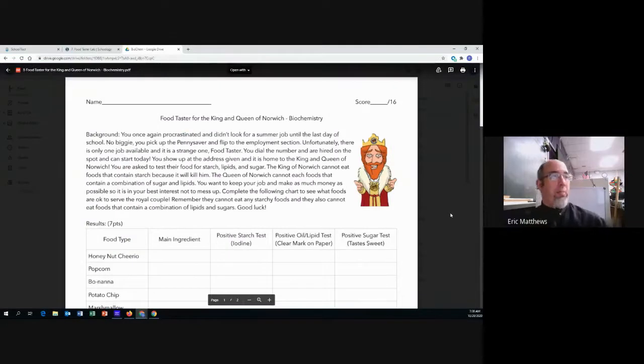So, you once again procrastinated and didn't look for a summer job until the last day of school. No biggie. You pick up the penny saver and flip to the employment section. Unfortunately, there is only one job available, and it is a strange one. Food taster. You dial the number and are hired on the spot and start today. You show up at the address given, and it is the home to the King and Queen of Norwich. You are asked to test their food for starch, lipids, and sugar.